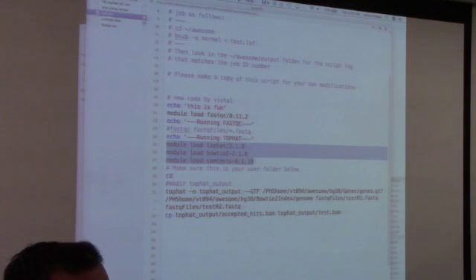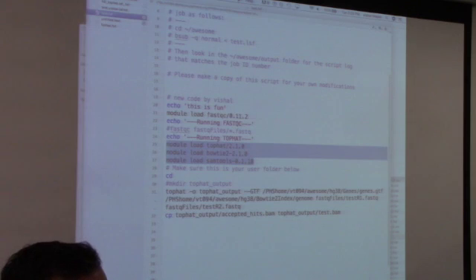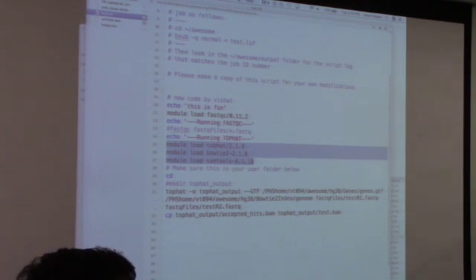There is one part to this that you will need help with: when you try to download the BAM file and open it in IGV, it will say it requires an index file. When it says that, email me and I'll tell you the solution, or you can Google it and it'll tell you the solution. So this homework is actually hard, the third part. It's not as simple, but we'll see. People need some challenge.